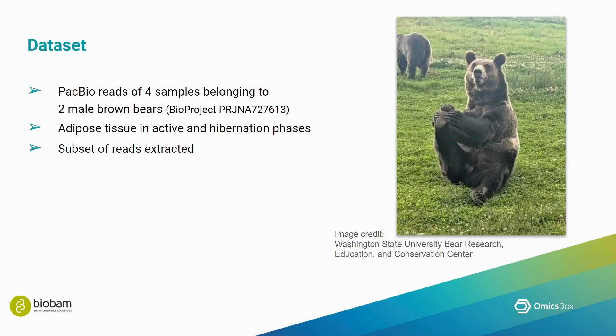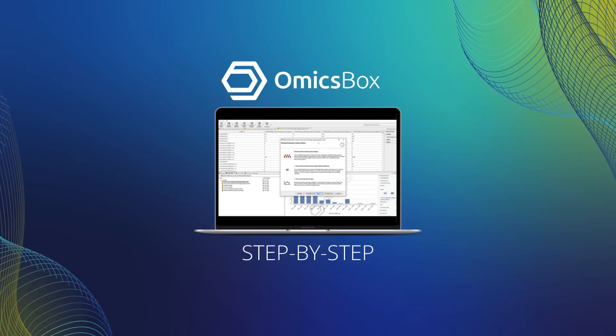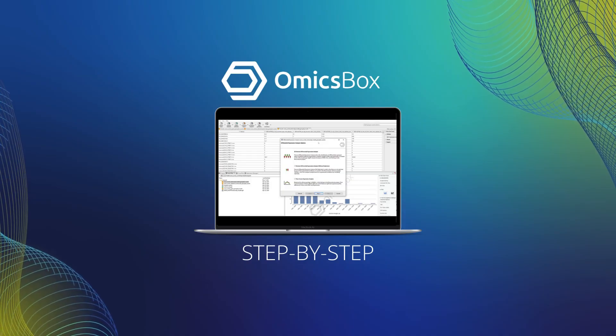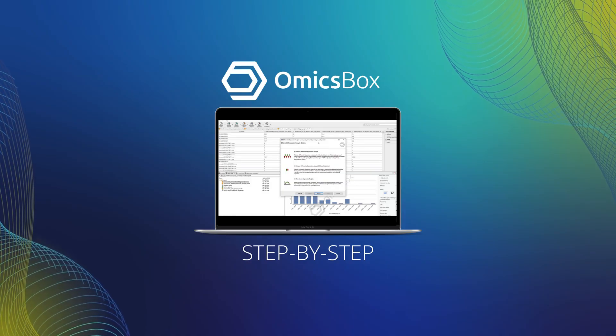In our demonstration today, we will be using PacBio long reads of four samples belonging to two male brown bears from the Washington State University Bear Research Education and Conservation Center. These samples represent adipose tissue in active and hibernation phases. For demonstration purposes, I have extracted a subset of the reads. So now, we can finally move on to OmicsBox.